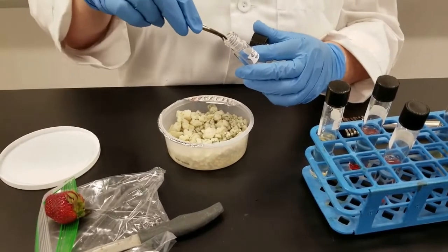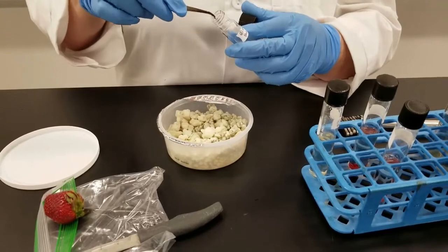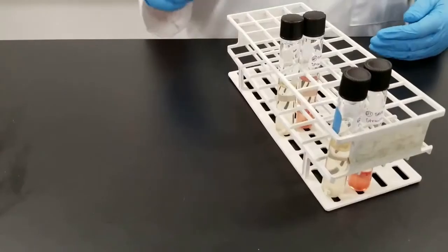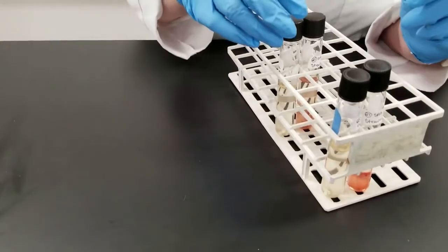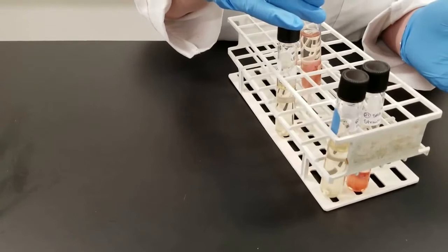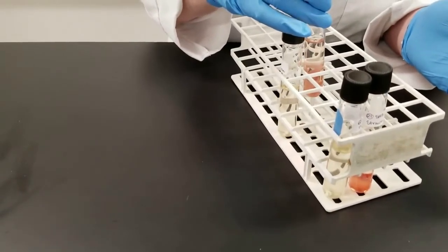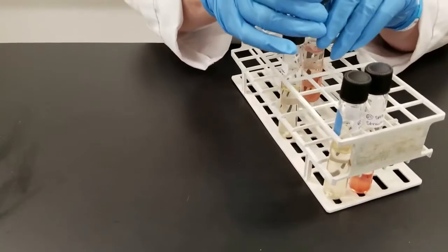We could grow this on a solid medium or liquid, so we're trying the liquid medium. This is our Sabouraud liquid broth, to stimulate the growth of fungi. Remember, this has a lower pH, so it tends to inhibit the growth of bacteria.